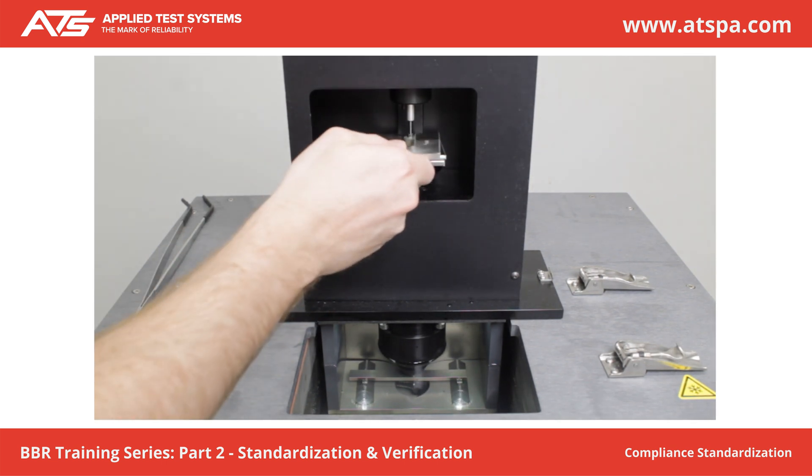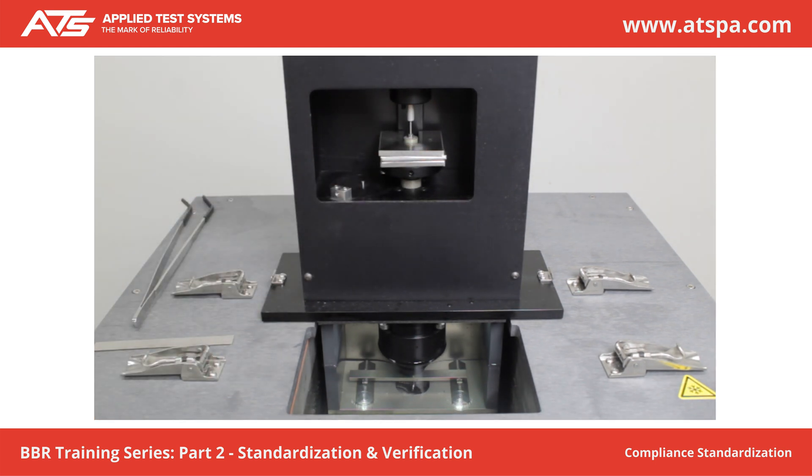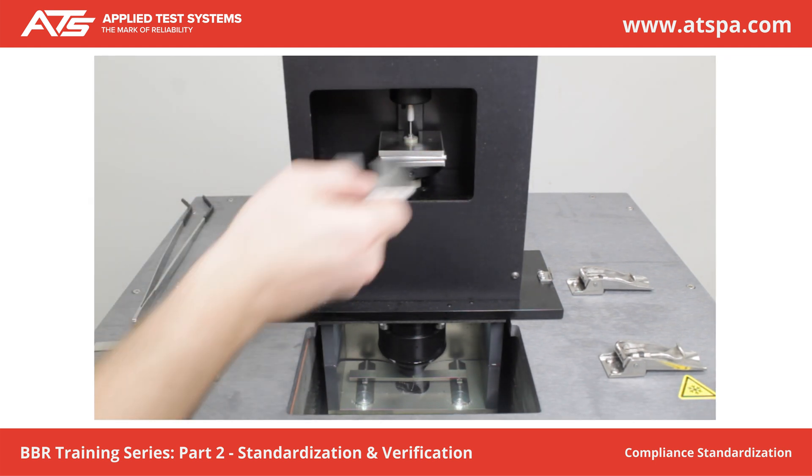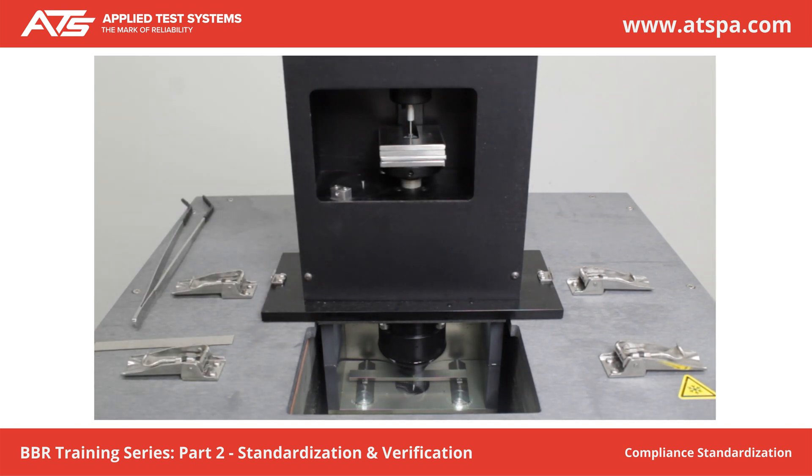Place Weight C on Weight B. Wait 5 seconds. Press Next. Place Weight D on Weight C. Wait 5 seconds. Press Next. Take note of the calibration constant. Press Finish.